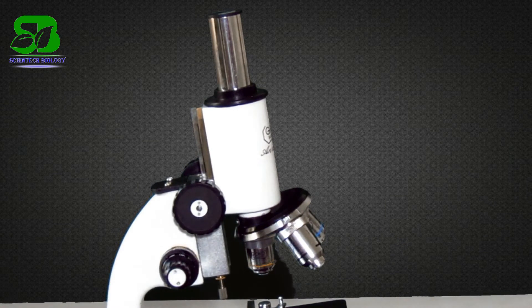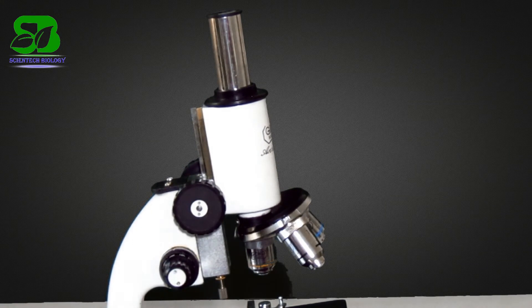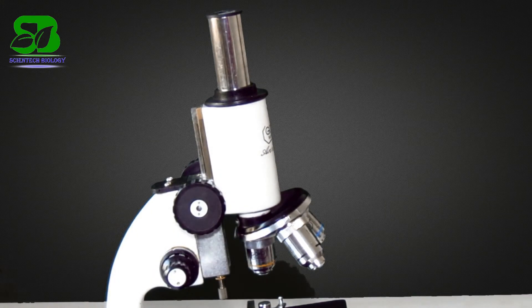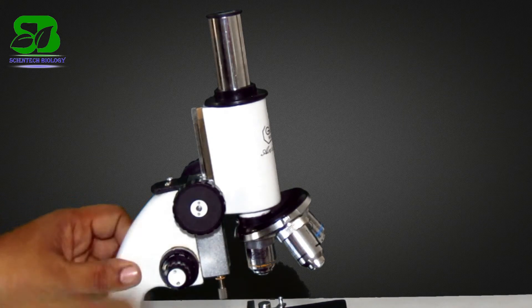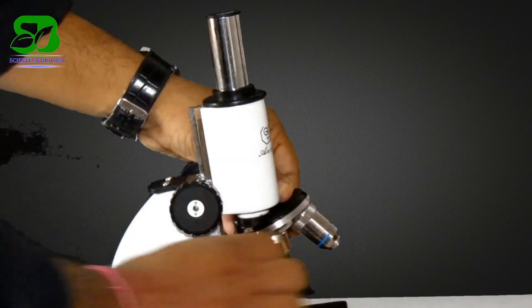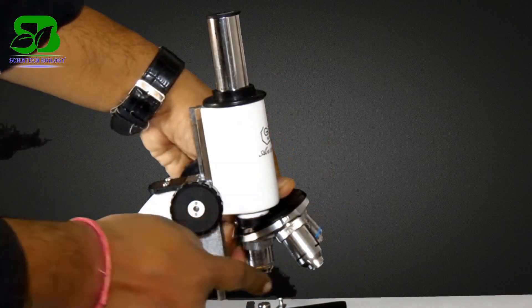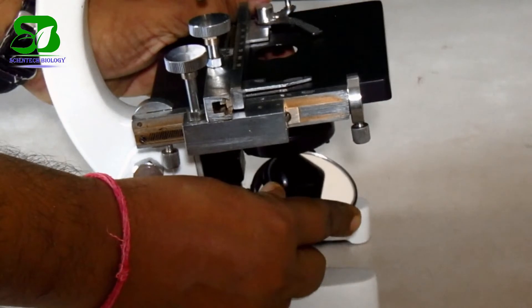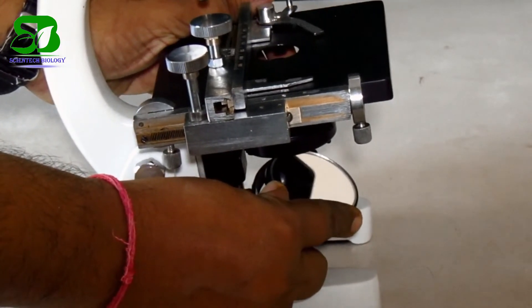Now let's see how to use this microscope to focus on slides. First, turn the nosepiece to bring the low power objective lens in line with the body tube. Now focus the mirror for maximum illumination.